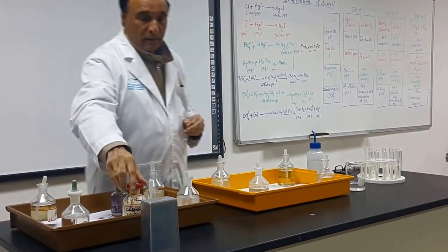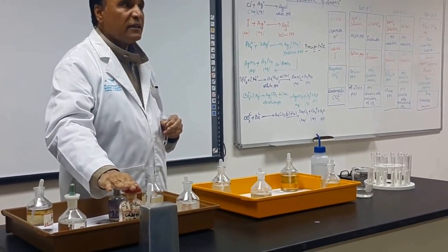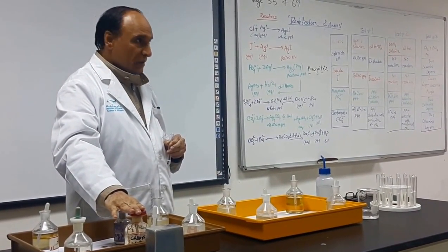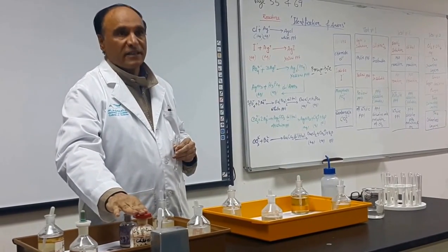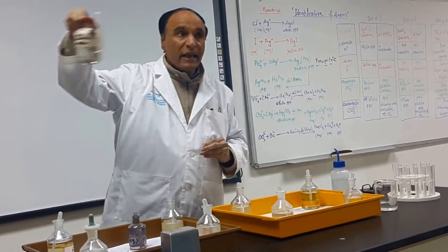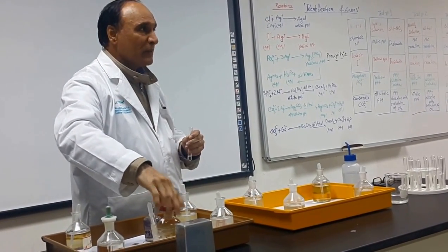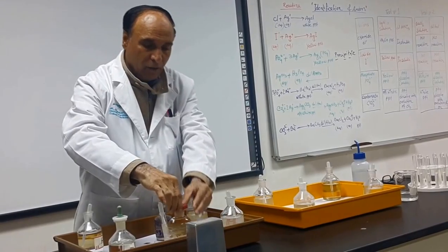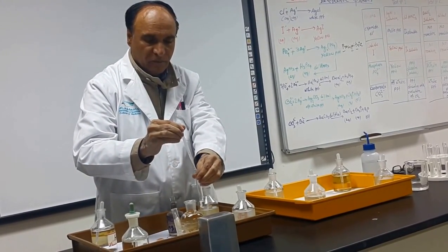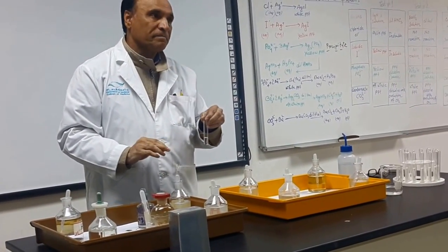Here is chlorine. It is a gas, and I have dissolved it in water. So it becomes chlorine aqueous. Did you understand? Yes. This gas is very dangerous. It can hurt us. It can damage our lungs. So it is tightly packed. I open it, take the chlorine water, put it in that, and close it in 3 seconds.